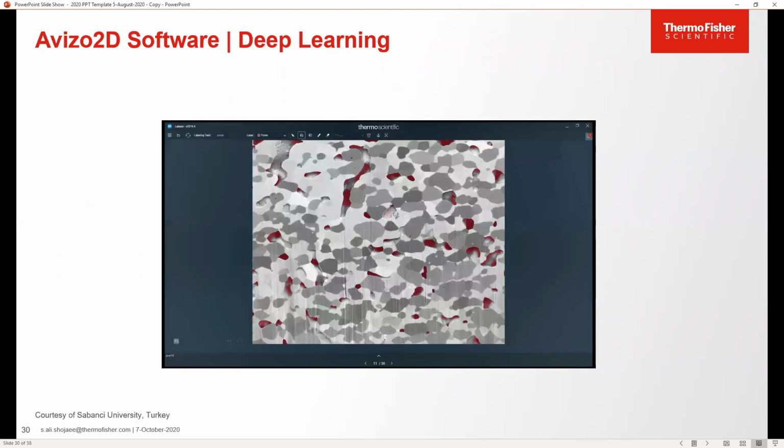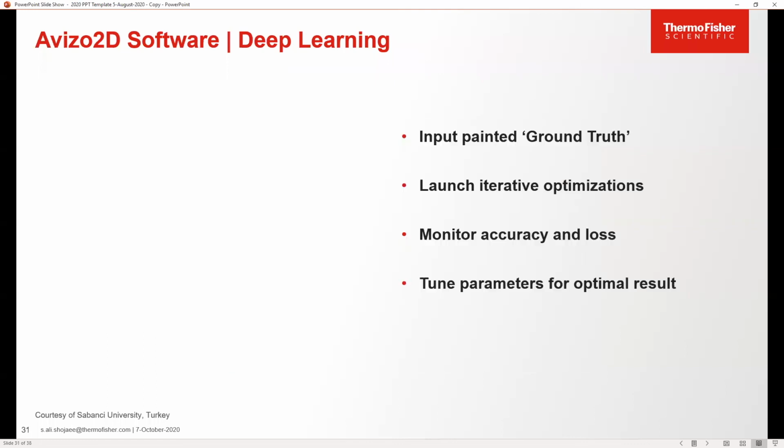For deep learning, I have this image, and then I have my not so good segmentation of the pore. I'm just going to go ahead and label it with whatever technique you want. This is fully manual segmentation, just painting over them, just cleaning it. Or you can use any other way that you want. You can use this labeler to define all the regions that are your actual pore. So I'm just giving it the answer in the most basic way that I can. But once I have the answer to my problem, finding the solution can be done using deep learning.